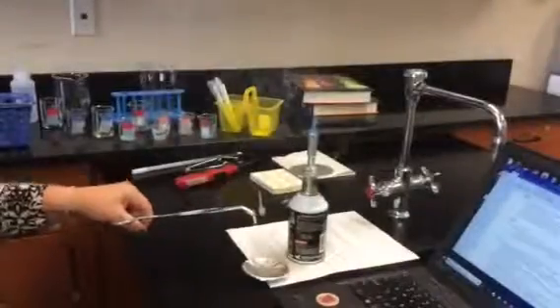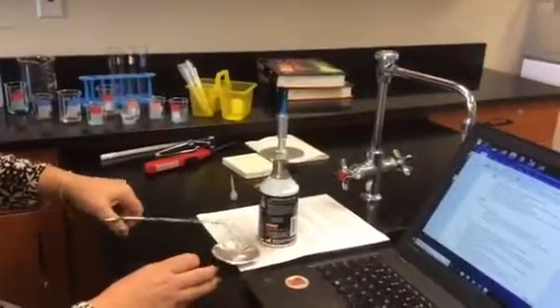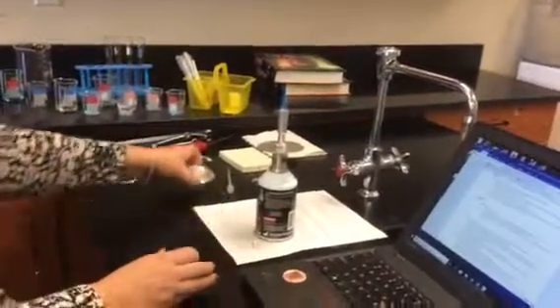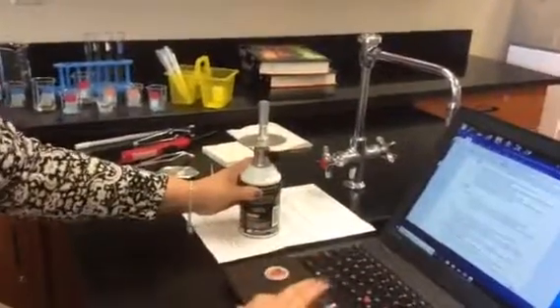Don't look at it. I think I'm getting it. I don't know. Okay, now you can look. Alright, so there you go. That's the reaction, and it turns into ash. So tomorrow you can definitely do it, but you just can't look at it as it's happening. Alright, so that was that one.